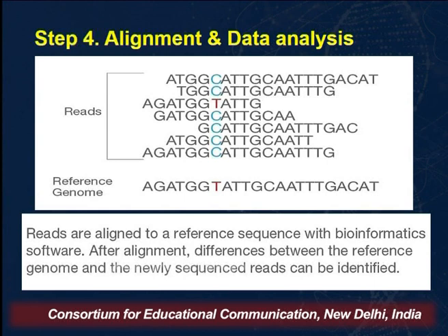When we talk about whole genome sequencing, how these reads are assembled to form a complete genome is a different aspect, and we will discuss it when we start the bioinformatics series, where we will discuss how the sequence data we have generated can be assembled or validated to give rise to the entire complete genome sequence. Here you can see all the reads are aligned together, and they can also be aligned based upon a reference genome. So there are two kinds of alignment that occur.